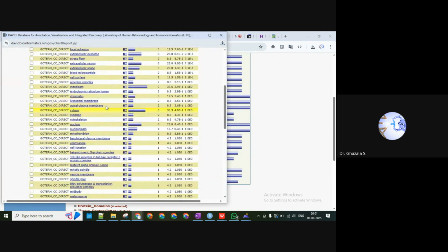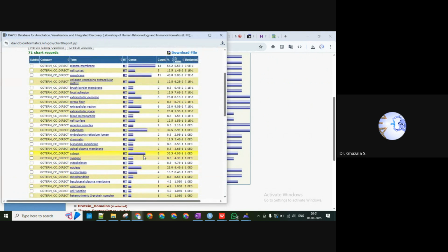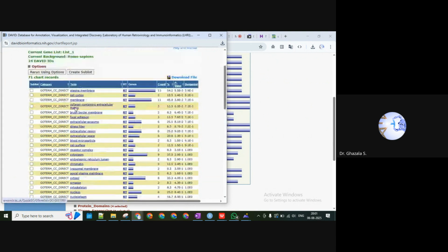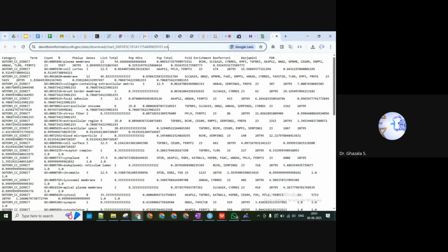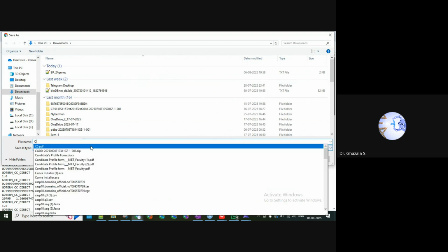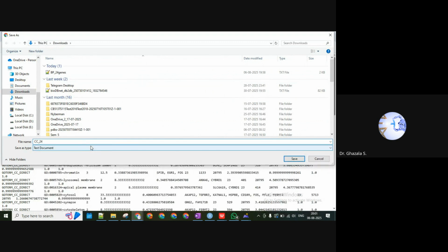But depending on our requirement and how many genes are involved, in cytosol you can see we have 8 genes involved, so a kind of considerable cellular component that we can get here, right? So that's why accordingly we modify the options if required, and we will download the file. We have the text file you can see on the bar, so you can directly press Ctrl+S and it will save. So cellular component for 24 genes. And later you can open these tables in Excel to see the data in tabular format.